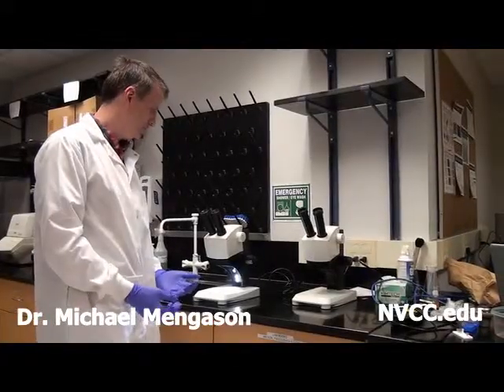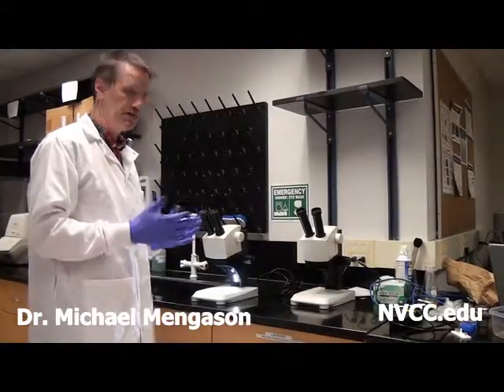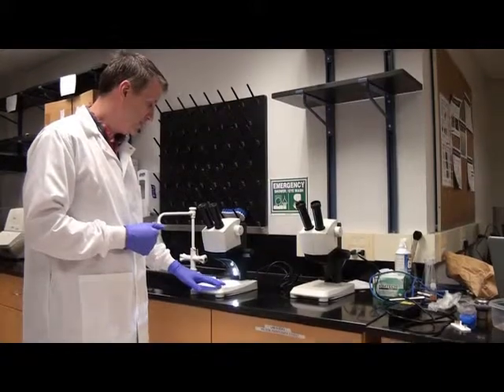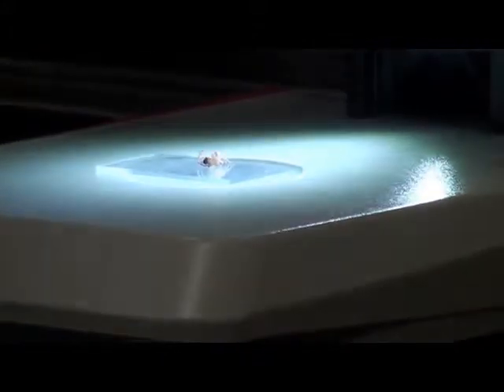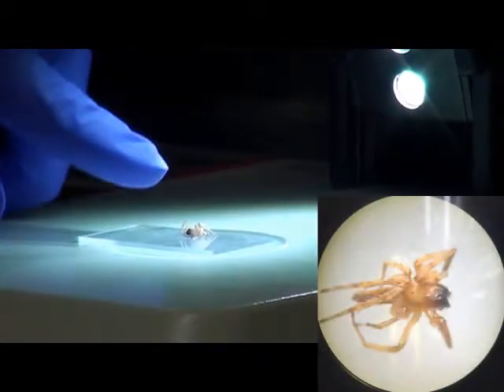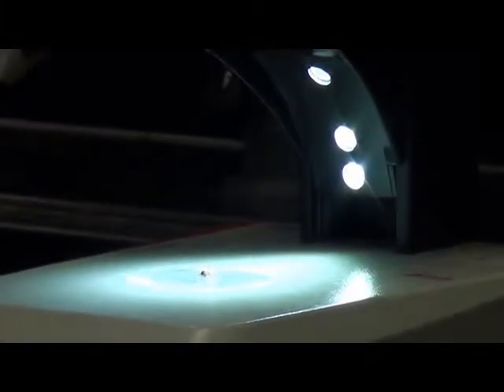One of the reasons you use any microscope is to look at fine features on the surface of something. Here we have a small spider and you might want to look at details of the eyes, details of small hairs on it. You would use an optical microscope where light comes down, strikes the subject, and goes up through the optics to your eye.